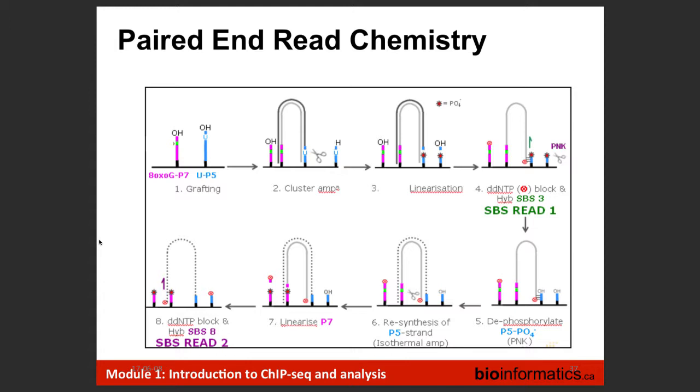I think someone had a question, yes. No, they're different things. Mate pairs, I don't know if people still do mate pairs, do they? Less and less. Mate pairs were a way of making long insert sizes. They actually involved generation of a circular fragment. This is not related to epigenetics. But I just read it somewhere.